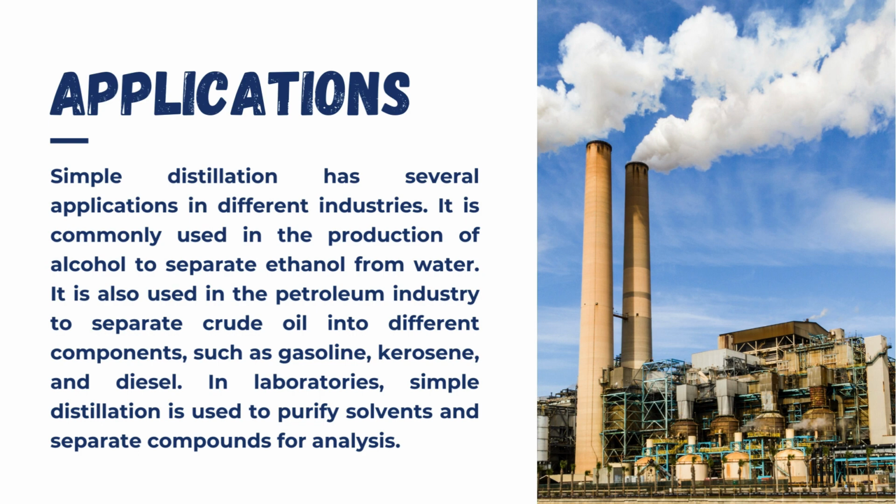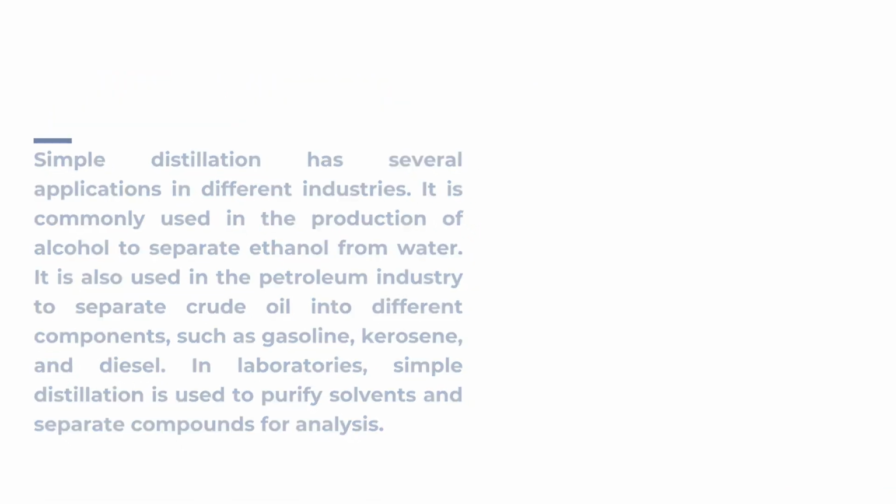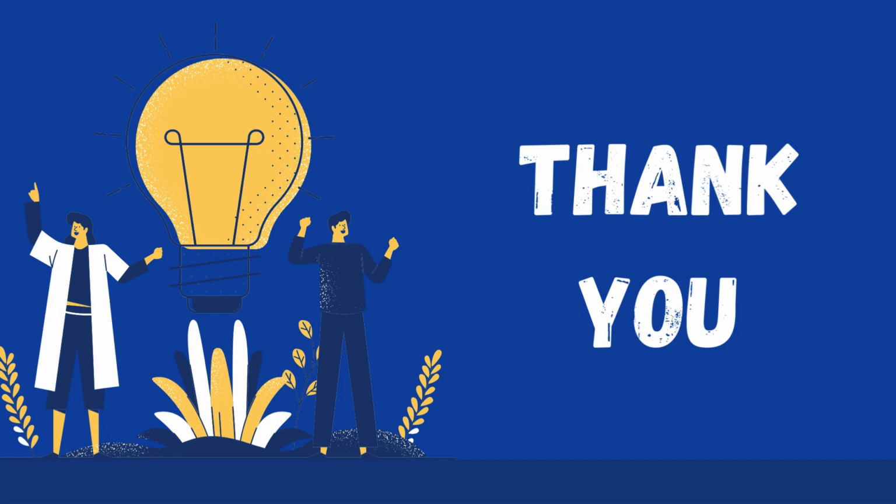So guys, this was all about simple distillation. Concluding the simple distillation video, simple distillation is a useful process that is used worldwide to separate two liquids that have different boiling points. It has several applications in different industries and is commonly used in laboratories to purify solvents and separate compounds for analysis. While simple distillation has its limitations, it remains an essential technique for separating and purifying liquids. I hope this video of simple distillation is clear to you.